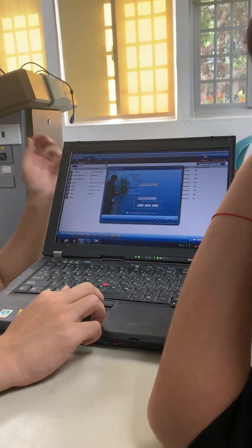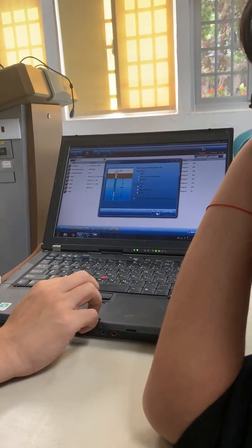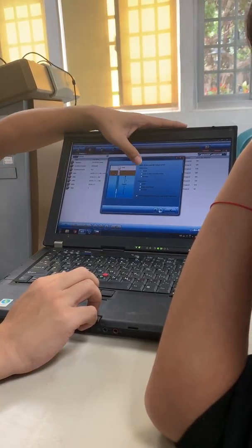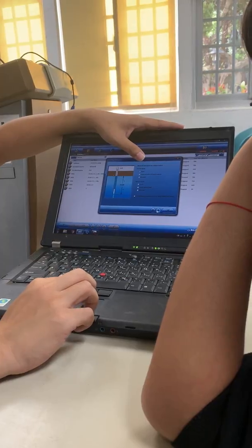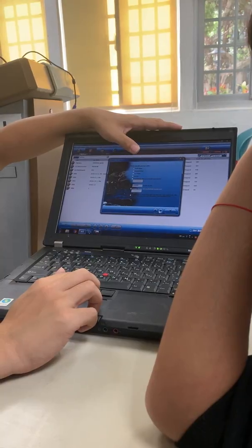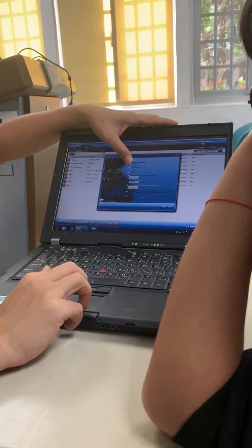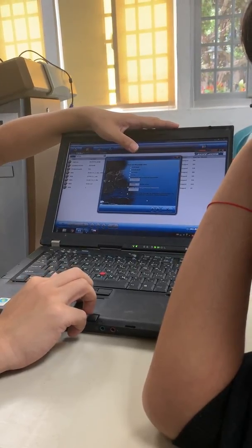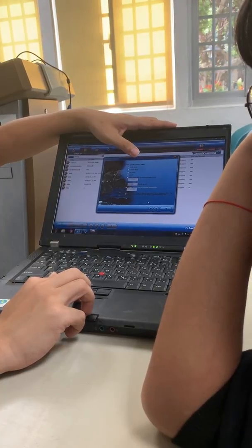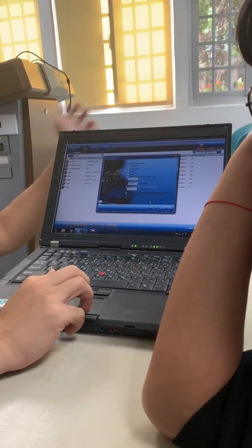I always suggest using manual start — just start it as soon as possible. For the depth definition, we use the first option — that is enough. For water type, we almost always measure fresh water, so selecting fresh water is sufficient. This setting is related to water density and how pressure is calculated.